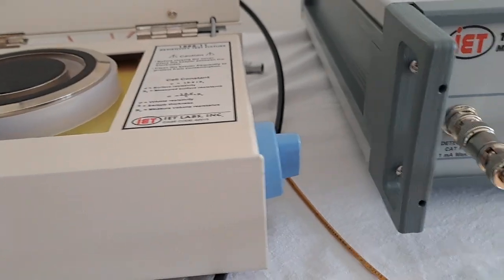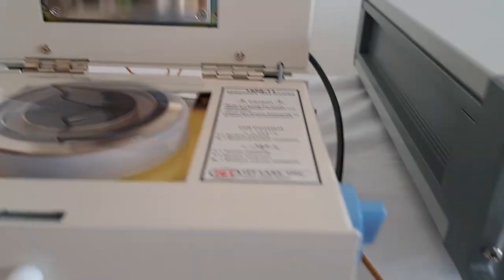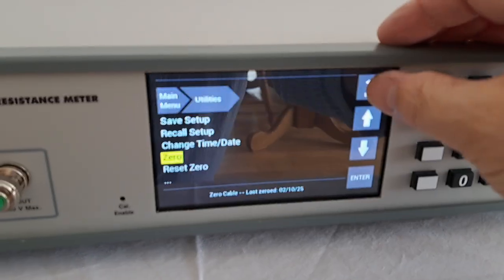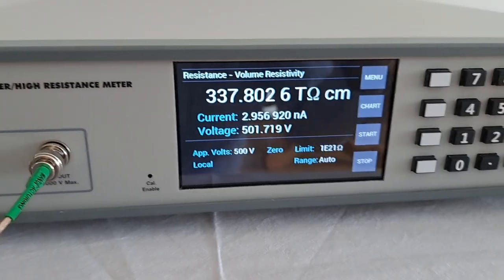In this case I'll put in a small sheet of polycarbonate. Once you have the polycarbonate in, close the cell, and at that point you can start the measurement.